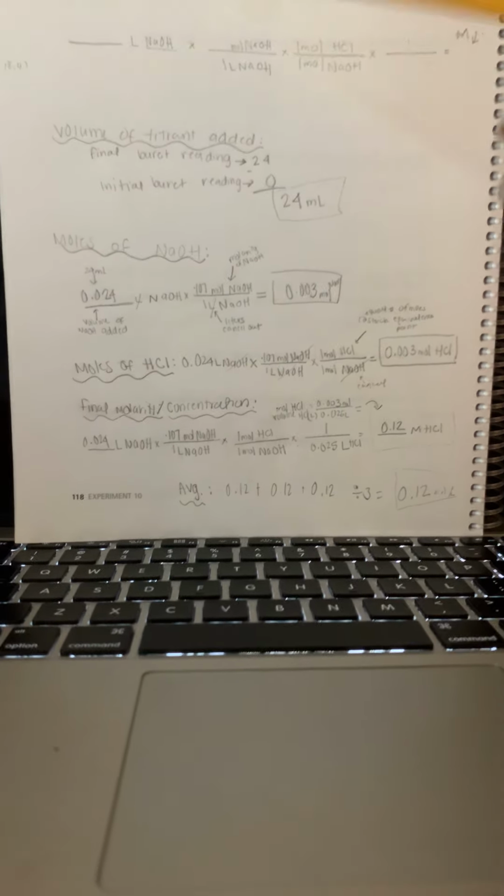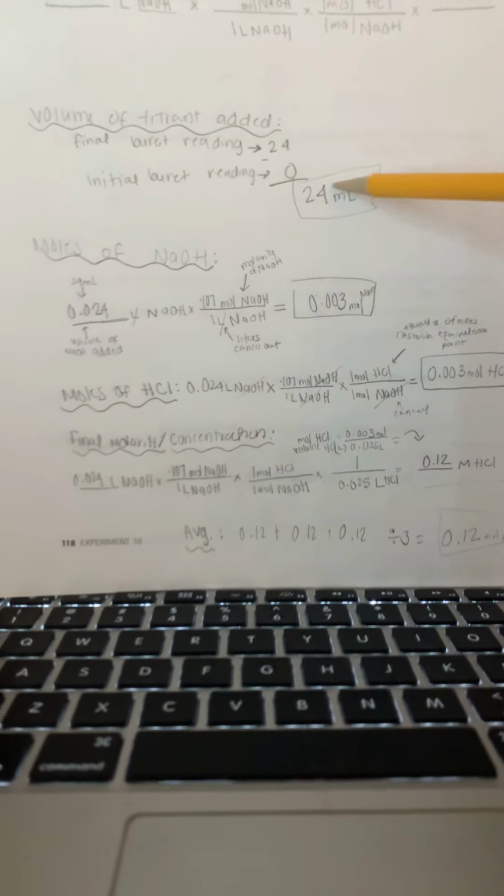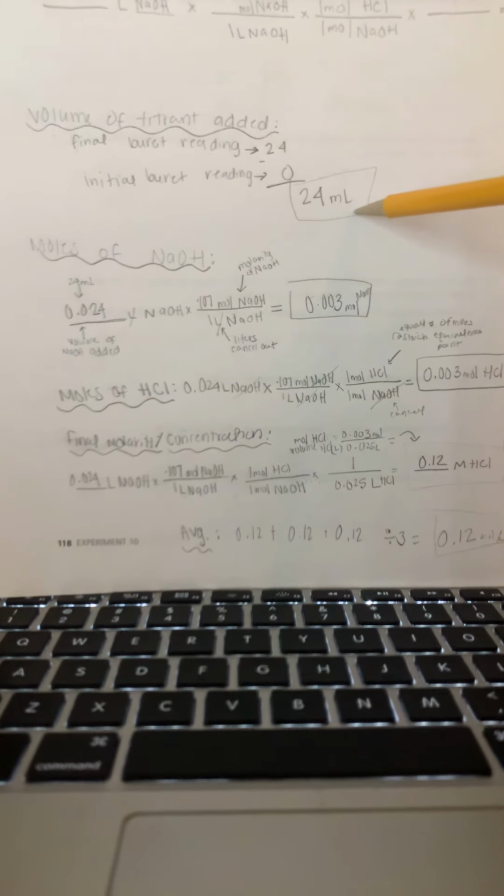So first off, I'm going to show you how to calculate the volume of the titrant added. The titrant that we used, of course, was the sodium hydroxide. We're going to take the final burette reading. When we had it in the burette, it was 24 milliliters. And then the initial burette reading was 0, because that's where it started in the burette. We just subtracted them and got 24 milliliters.